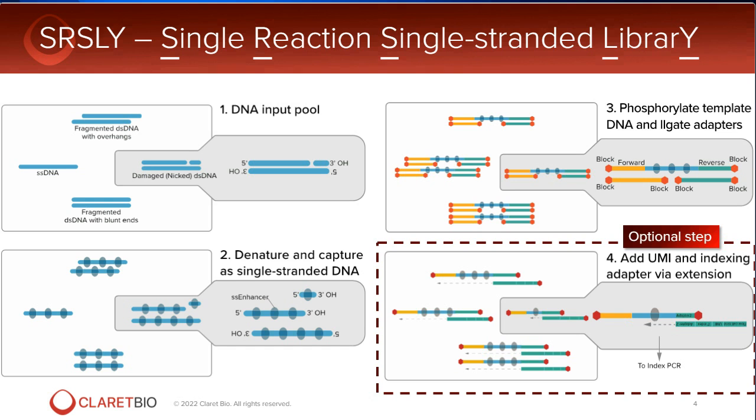So if we just look at the forward one, for example, the adapter is duplexed where this orange or yellow appears together between the top and the bottom of this, here and here. Oops, I can only do one at a time. There we go. And then at some point, there is a splint overhang that happens here. This anneals to the template DNA in Watson-Crick base pairing fashion, creates a localized double-stranded molecule of DNA that allows a double-stranded ligase to ligate the adapter to the template DNA.